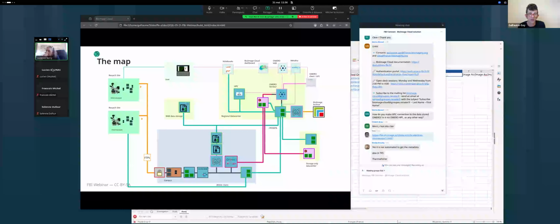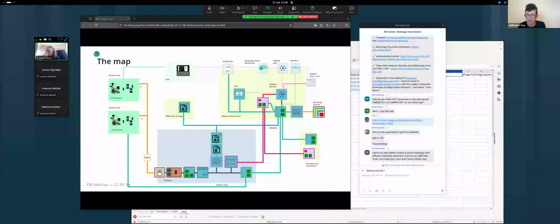There are various white papers on minimal metadata. Or you can be Tom Boissonnet and write the parsers and try to write Python scripts, but if it's not encoded in the proprietary file format, and not possible to extract from it, it's a problem.